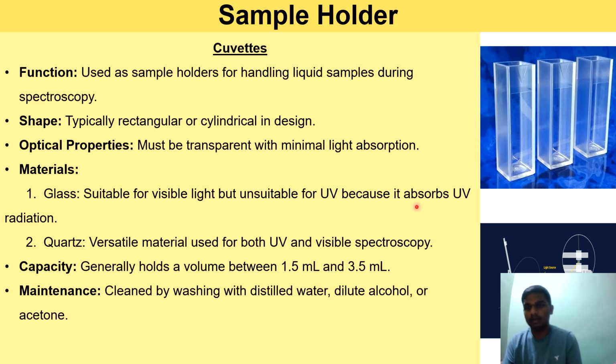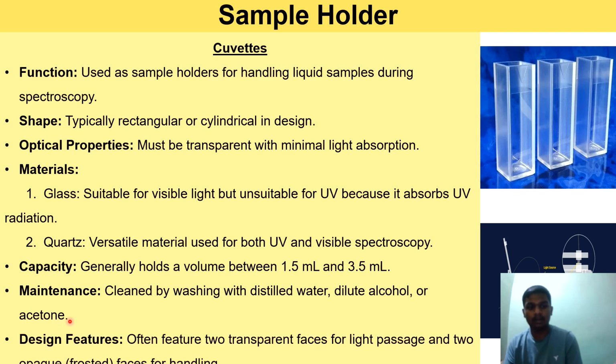For every trial, we should clean it. It can be cleaned using distilled water, dilute alcohol, or acetone. If you see here, based on design, it often features two transparent faces. This is a transparent face and this is an opaque face.